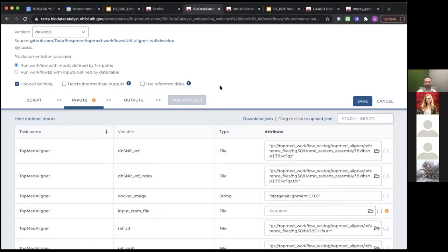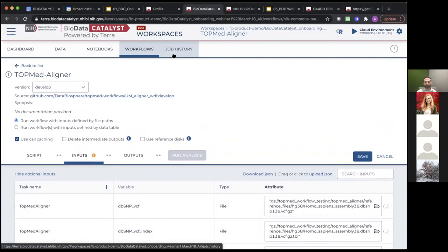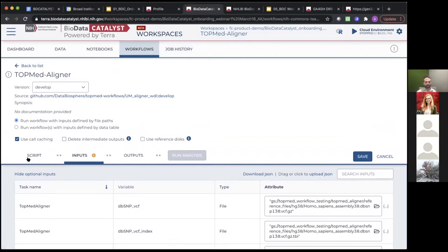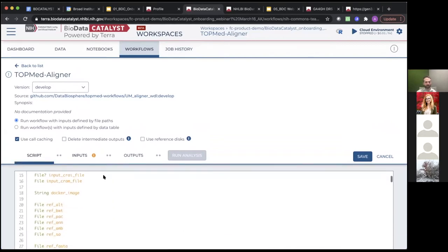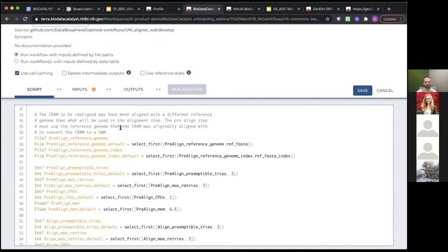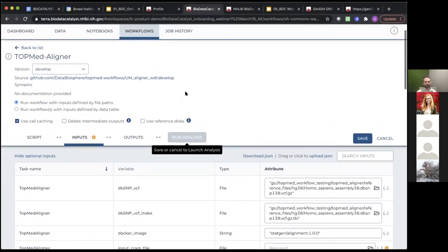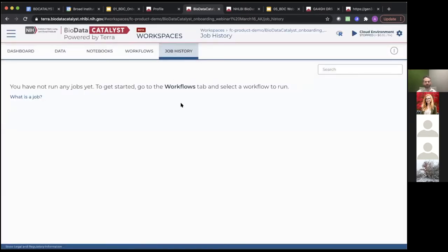In the workflow view, you can also look at the WDL script for that workflow — you can't edit it in this view, but you can see what the script looks like. Once you've saved everything with the required inputs, you'll be able to launch the analysis. Once launched, it shows up in your job history tab, which contains all workflows run in this workspace, links to the outputs, and useful information about how those workflows ran including any errors.